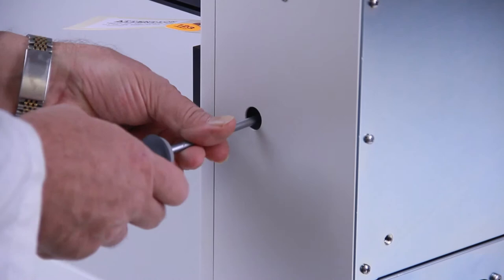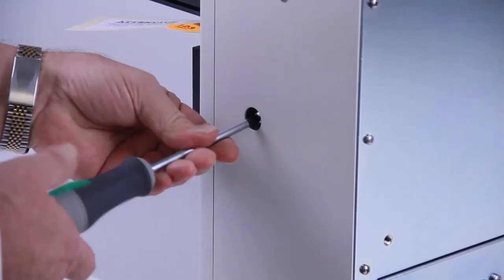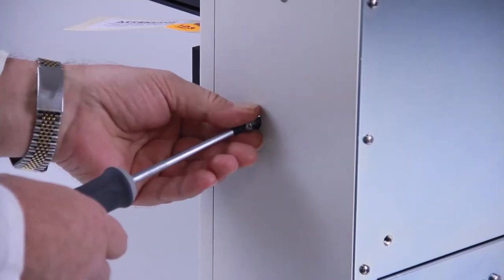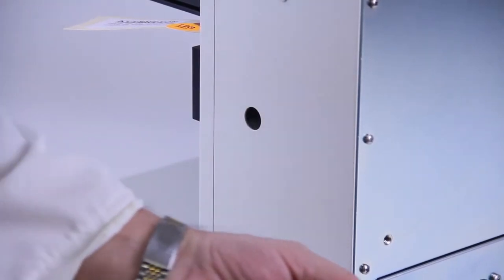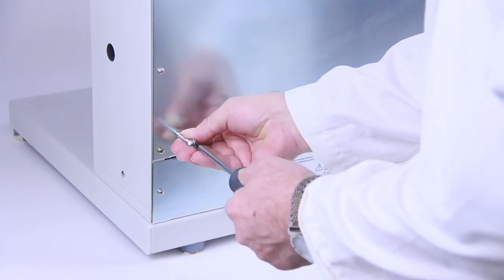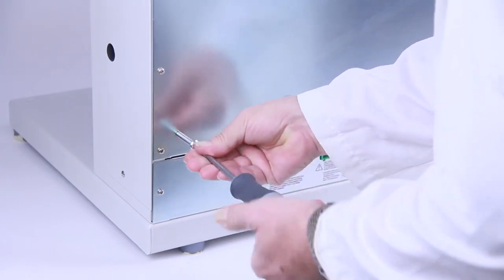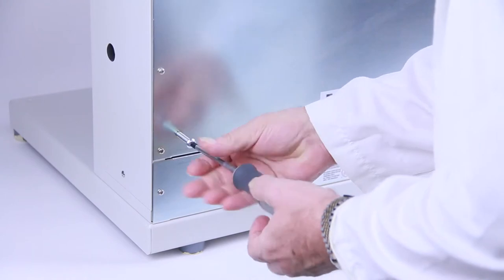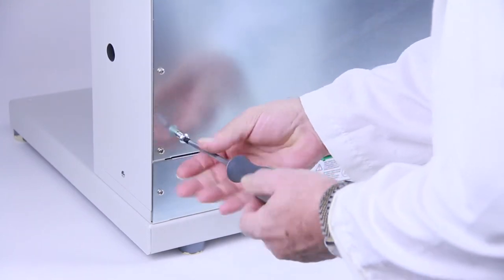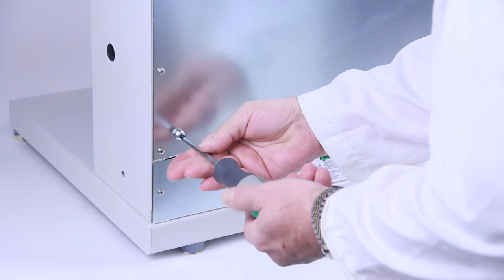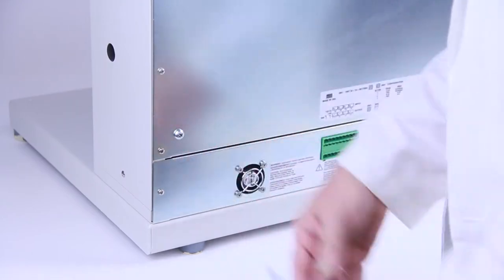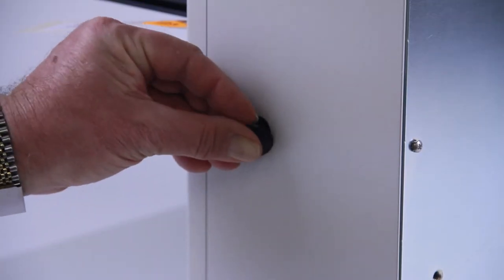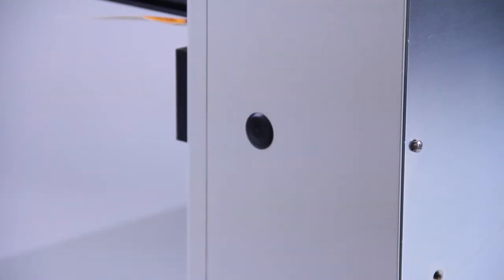Use a Phillips screwdriver to remove the locking screw. Insert the arm locking screw into its storage location on the rear panel. If you ever need to repack the unit for shipping or storage, be sure to secure the horizontal arm again with this locking screw. Replace the plastic plug on the side panel.